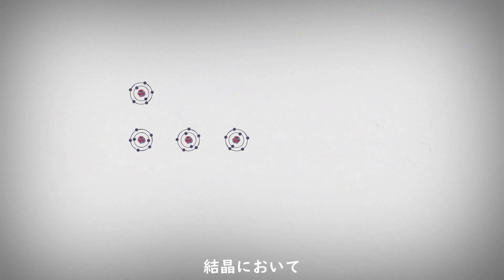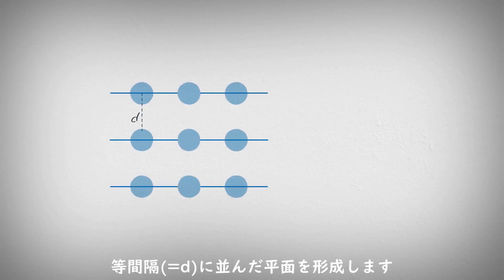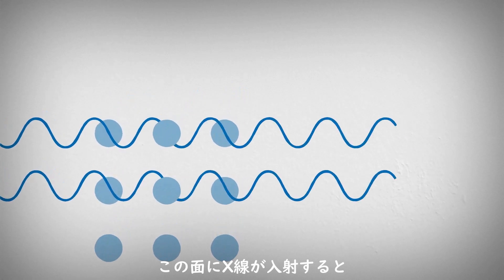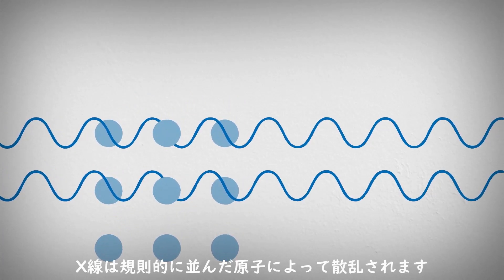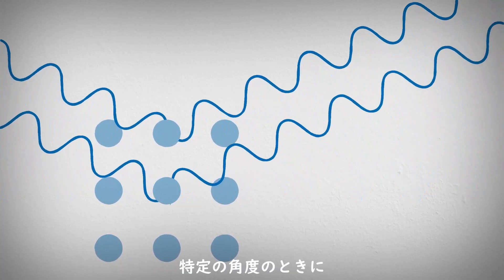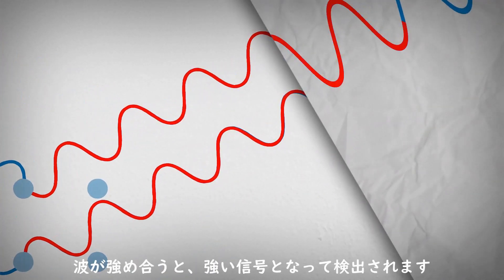In a crystal, the repeating arrangement of atoms form distinct planes separated by well-defined distances. When the atomic planes are exposed to an X-ray beam, X-rays are scattered by the regularly spaced atoms. Strong amplification of the emitted signal occurs at very specific angles, where the scattered waves constructively interfere. This effect is called diffraction.